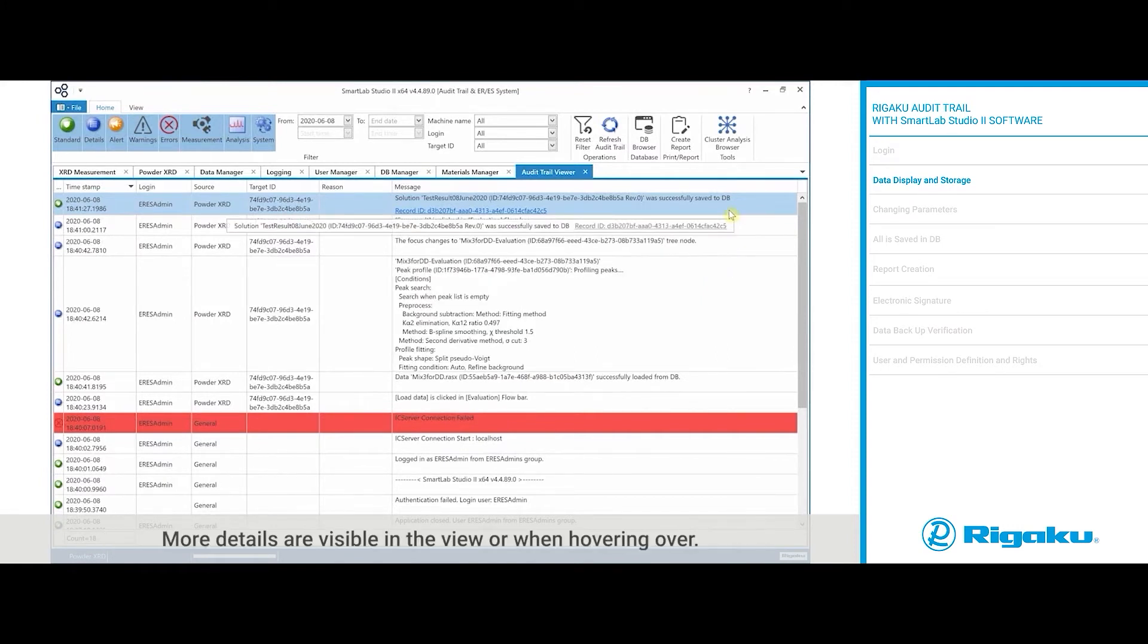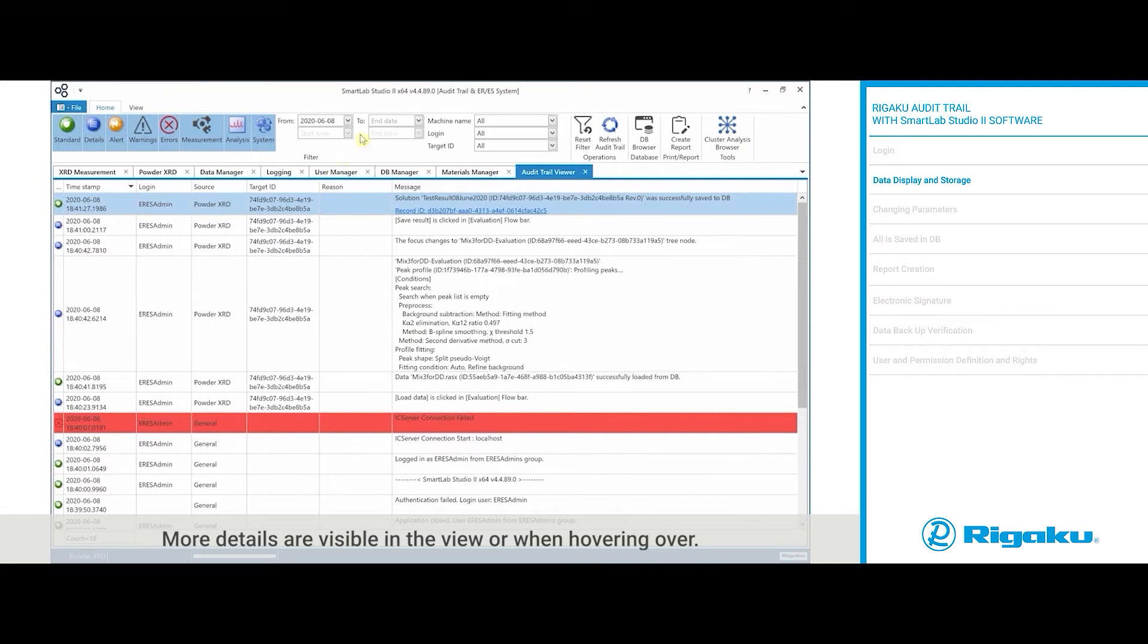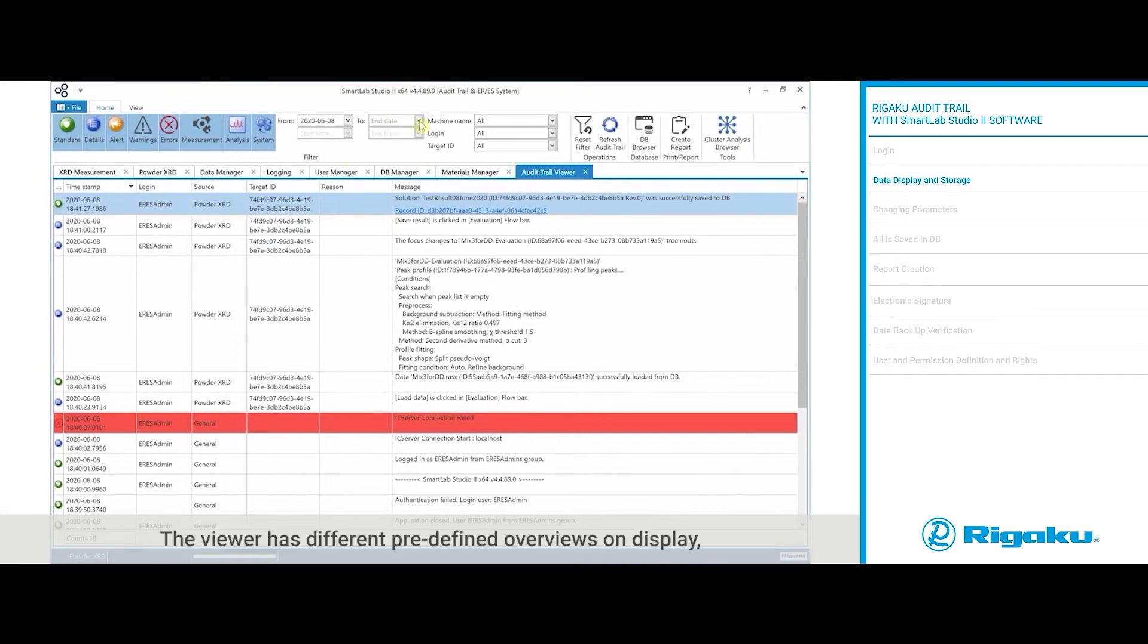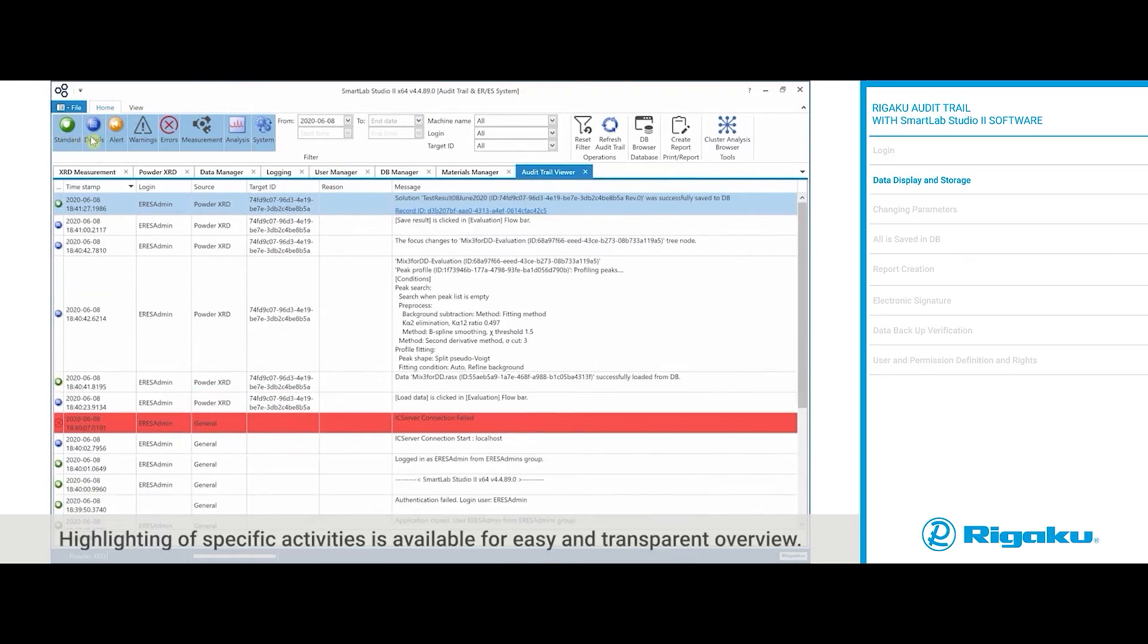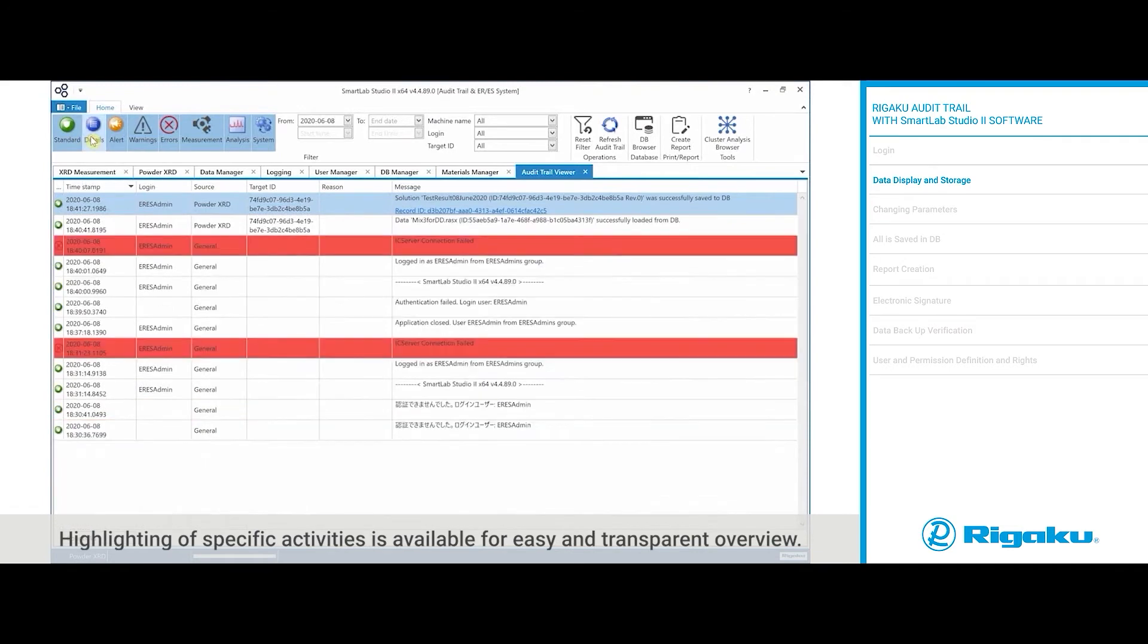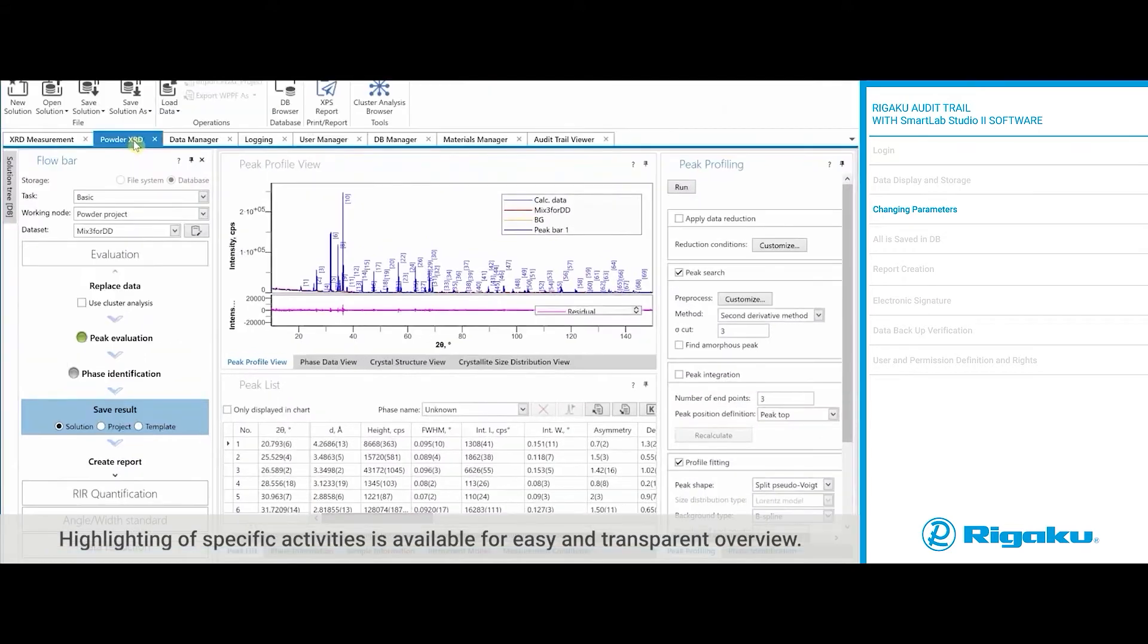More details are visible in the view or when hovering over. The viewer has different predefined overviews on display, which can be customized as well. Highlighting of specific activities is available for easy and transparent overview.